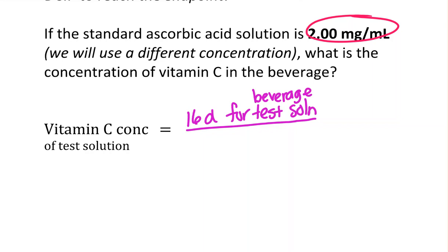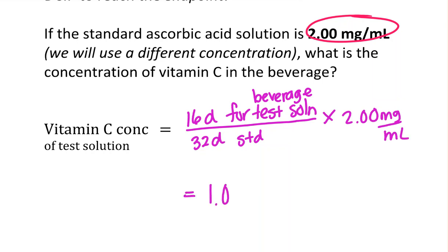So our beverage is our test solution. Drops for our standard solution. And this standard solution was 2 milligrams per milliliter. Yours will probably be something different. And there we get our concentration for our beverage.